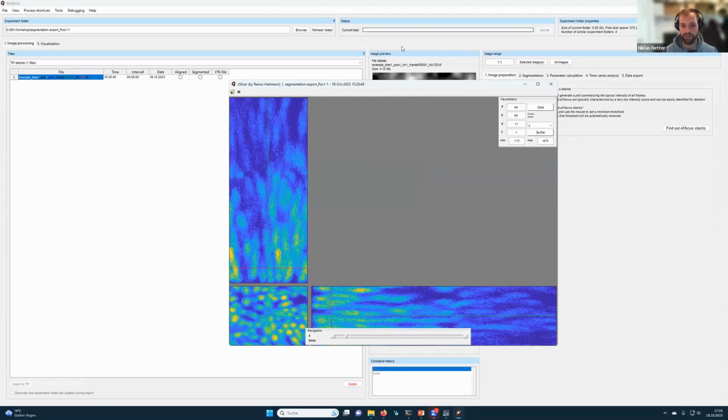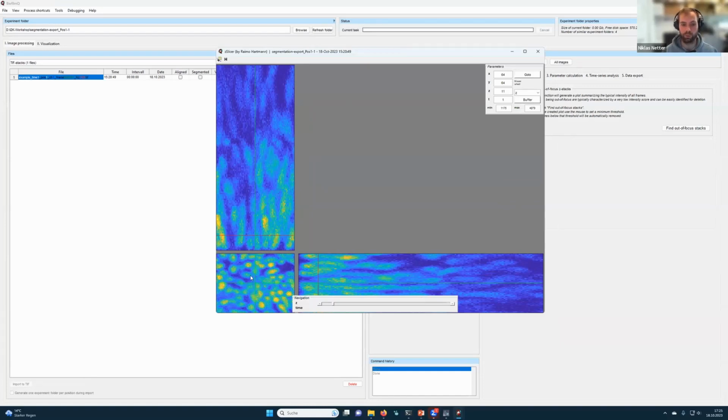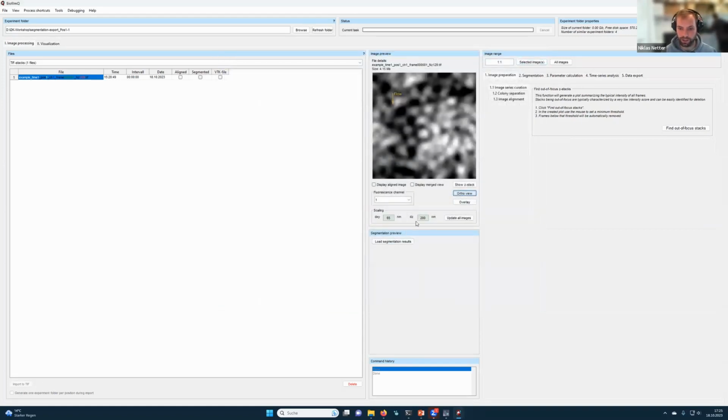And we already readily see that there's something wrong or weird because this spacing here is too much. So our XY image is very small and our Z direction up here and down here is pretty big. So we have to go back and change the scaling. It's currently set to 200 nanometers, but when we acquired the data, we used confocal images with 100 nanometers set spacing. So we will change this to 100.